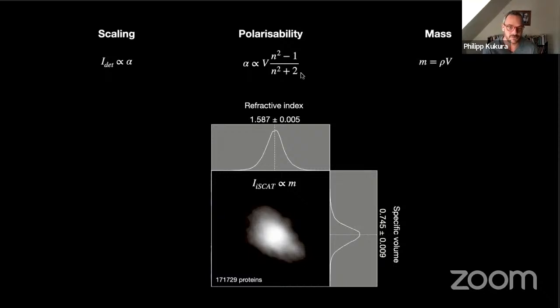Then you think about volume. Well, really simply speaking, proteins are all kind of the same size, right? Roughly speaking. I mean, if you've got a 50 kilodalton protein, maybe 4 nanometers, 5 nanometers in diameter, and you could take 1,000 different 50 kilodalton proteins, and they're all roughly 4 or 5 nanometers in diameter. So it's not like some are 50 nanometers and some are 1. The size does not change.